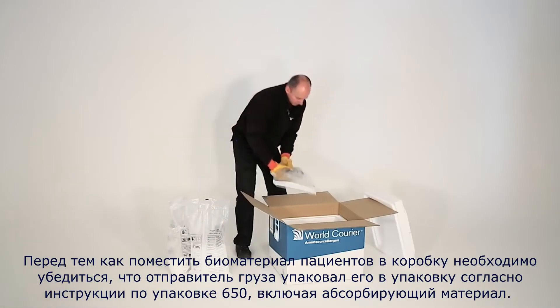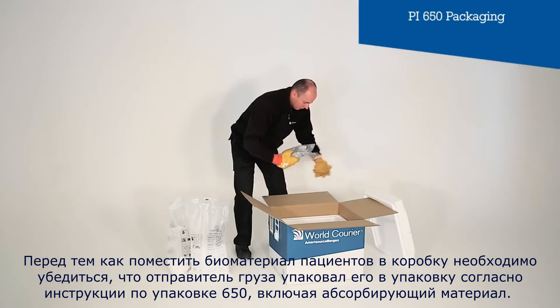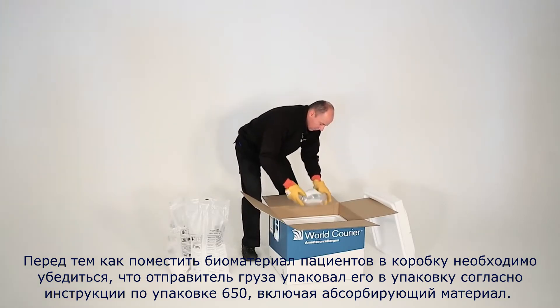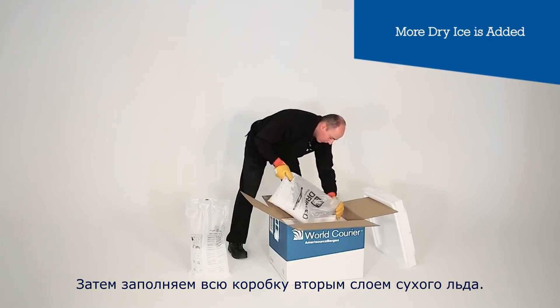Before placing patient samples inside the box, we ensure they're packed by the shipper into Packing Instruction 650 compliant packaging, including absorbent material. We then fill up the entire box with a second layer of dry ice.